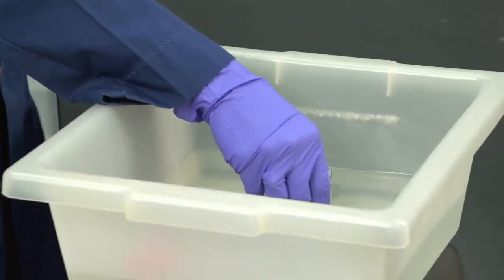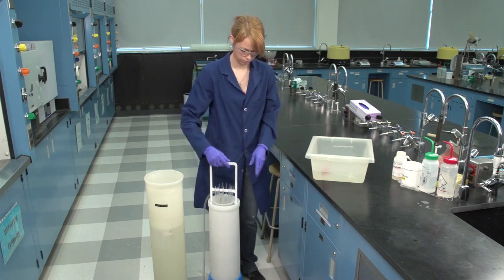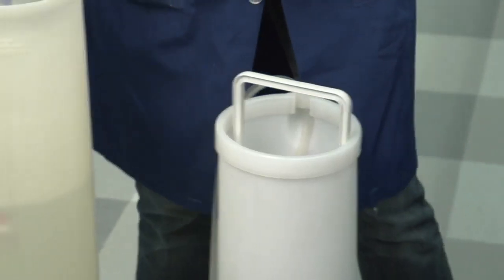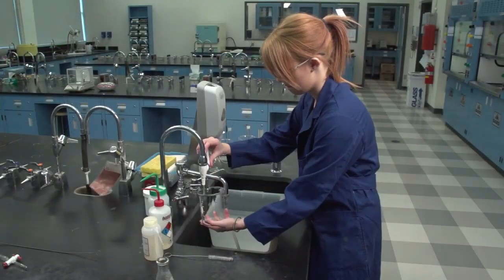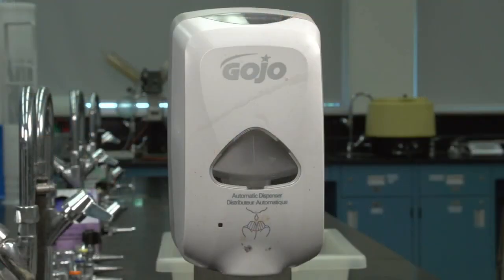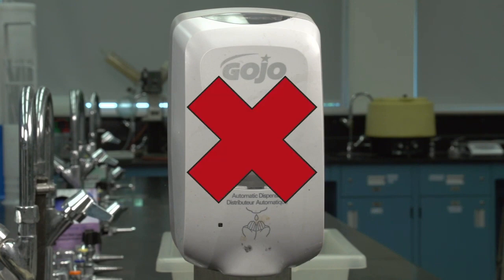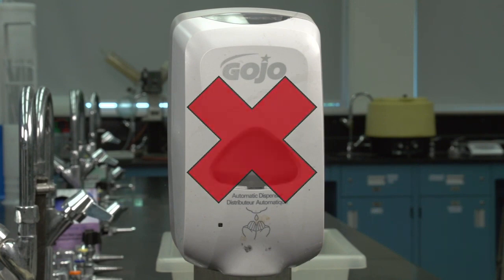To remove stubborn stains, soak the glassware in a detergent solution. The soaking process can be either hot or cold and can continue for extended periods of time. After soaking, rinse the glassware thoroughly with tap water followed by a small distilled water rinse. Never use hand cleaner or soap. Hand cleaners usually contain hand lotion additives which leave an oily film on the glass.